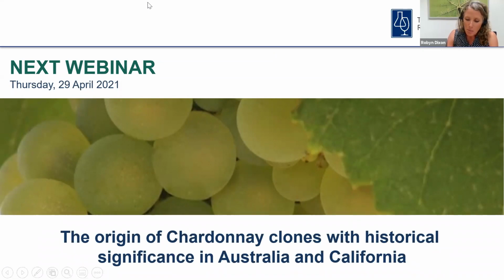Sounds like the Botrytis antigen detection method has some really good potential in terms of its specificity, low cost, and the low time required. We've got a question about sample preparation for that method.